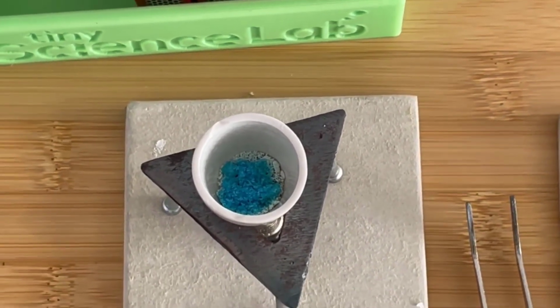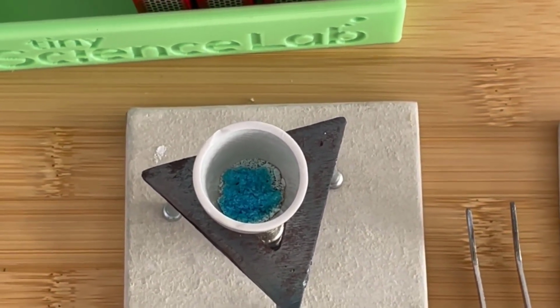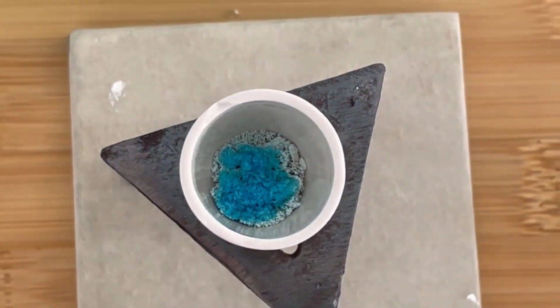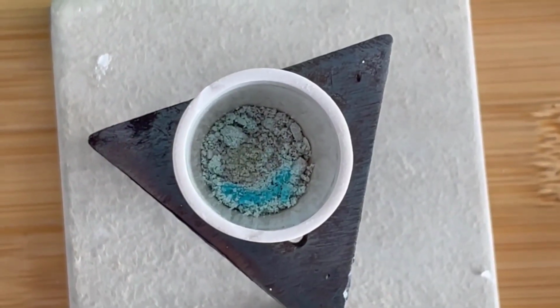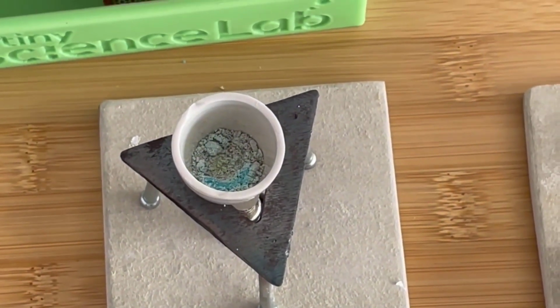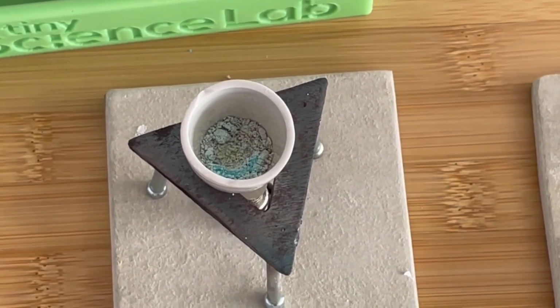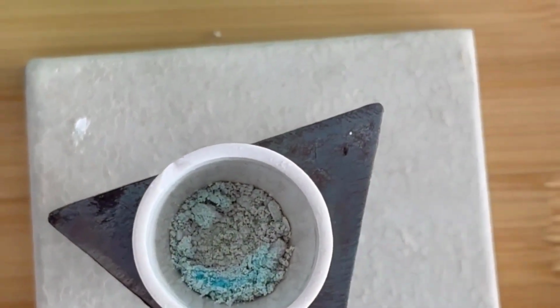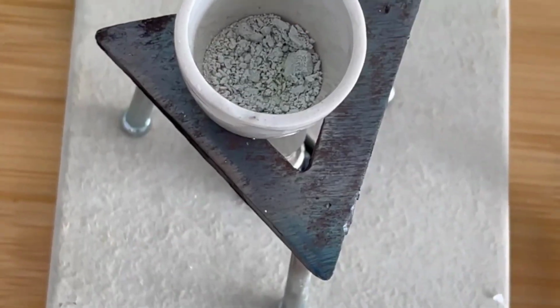The powder's almost white. So when you say what color is copper sulfate, actually it's pretty close to white. All those beautiful blue crystals have almost all completely lost their color. So that's telling you something about how the water molecules in the structure are interacting with the light that's coming into the crystals.